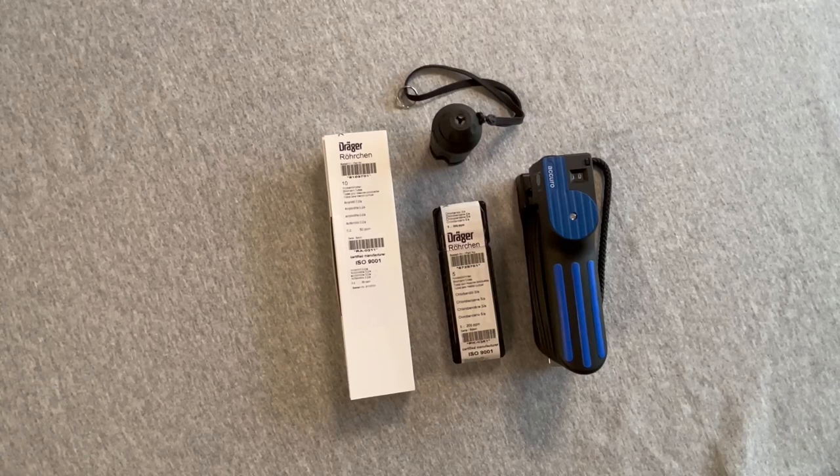Always consult the IFU sheet included in each package of tubes to understand the measurement procedure, proper use, and the required number of pump strokes. That's the conclusion of the clarification of the two-tube systems. Thank you.